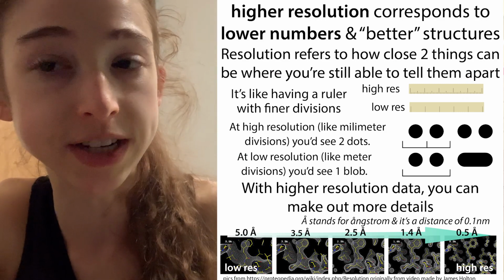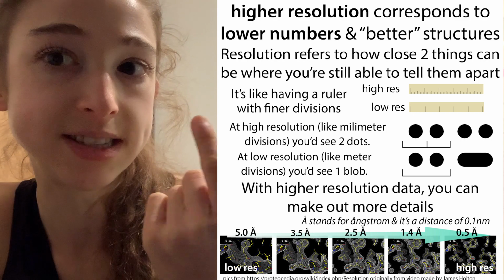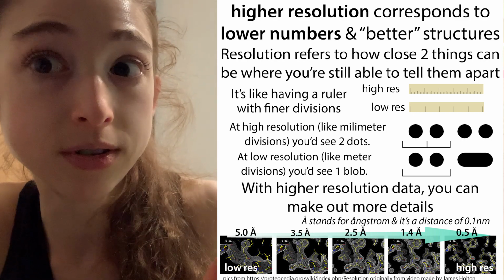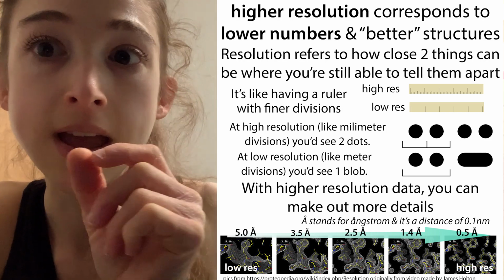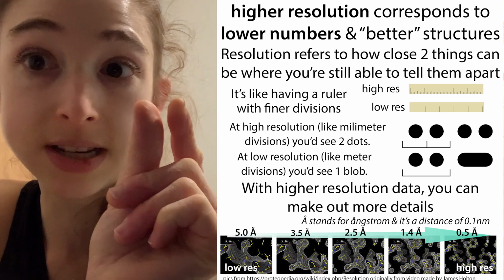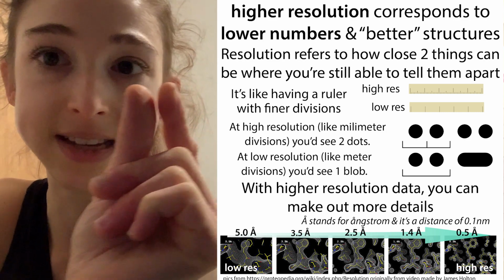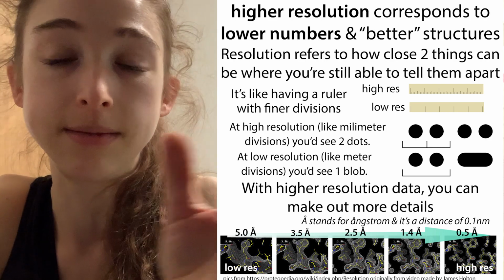And so resolution refers to how close together two things can be while you can still tell they're separate things. So the lower number is going to be a higher resolution, because this is basically saying I can tell that these are apart at a high resolution. So with a low number, I can say, okay, these are a centimeter apart. But what if you only have a resolution of like a meter?